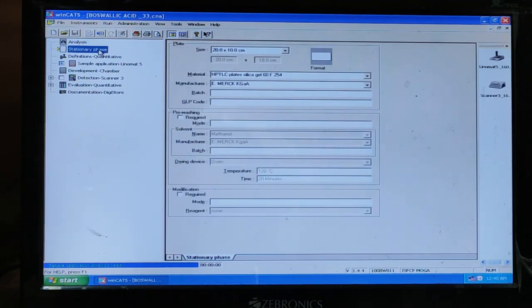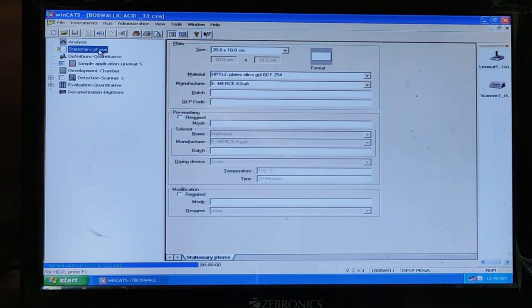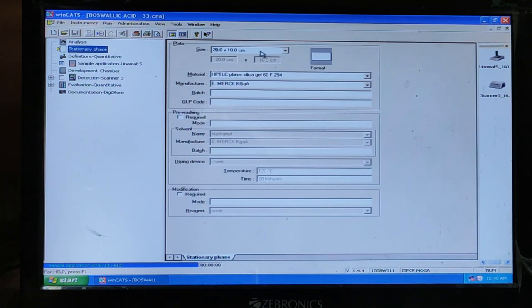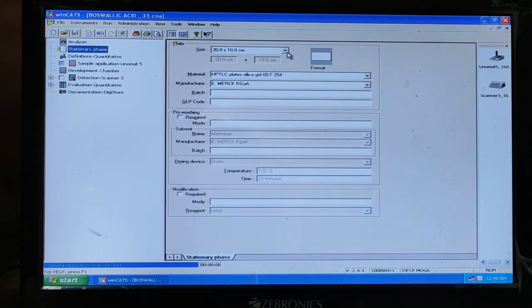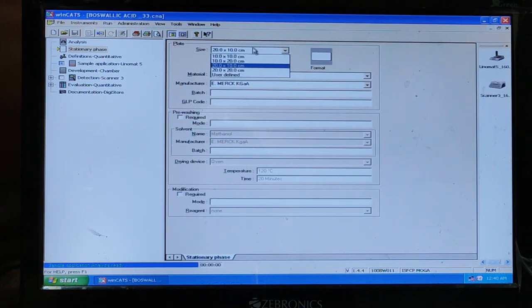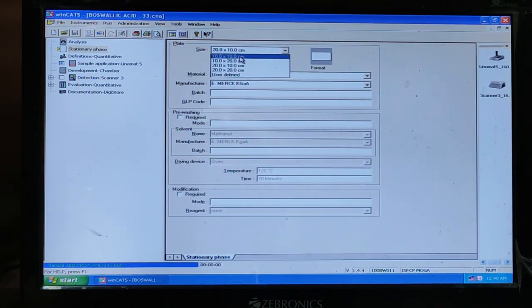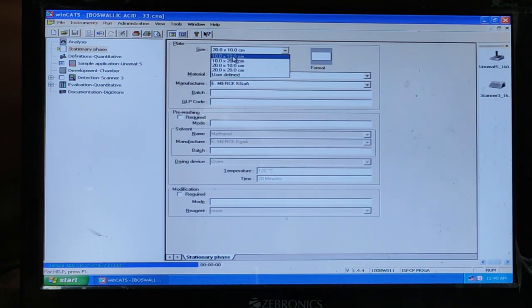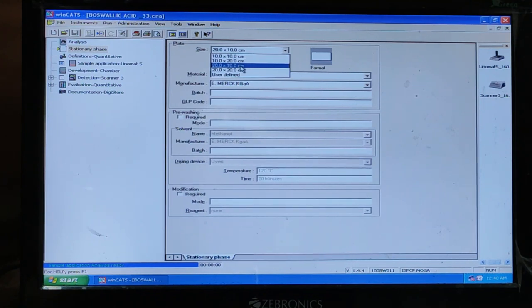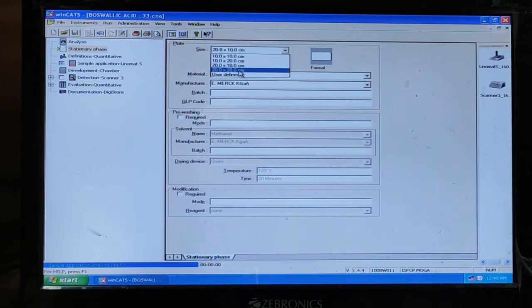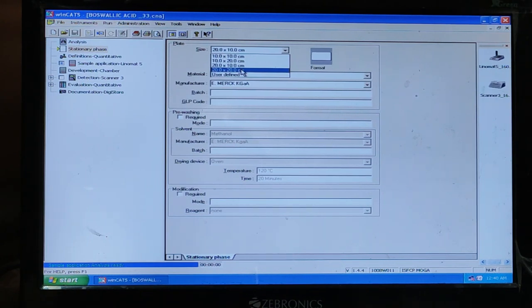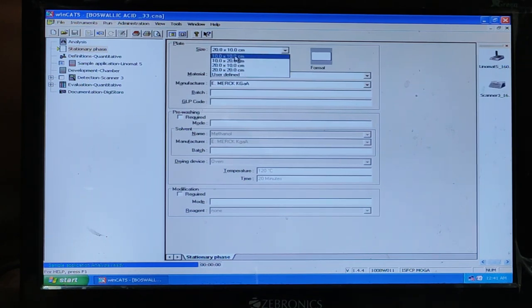This is the second part. This is very important. The name is stationary phase. And here you can choose the plate size. So we have the range in this software: 10 by 10 centimeter. Always keep it in your mind. Centimeter, unit is centimeter. 10 by 20 centimeter, 20 by 10 centimeter, and finally 20 by 20 centimeter. So you can choose the size of the plate as per your experiment requirement.